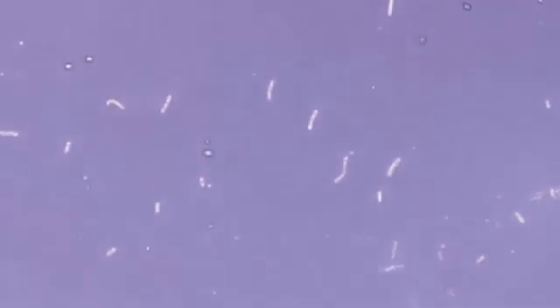This is 10 times. 40 times. And we'll jump up to oil immersion.